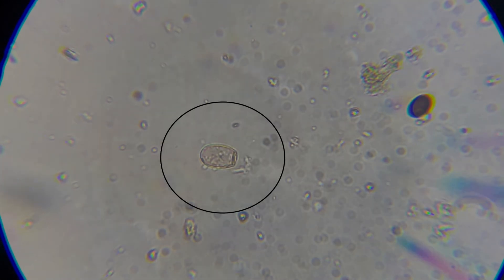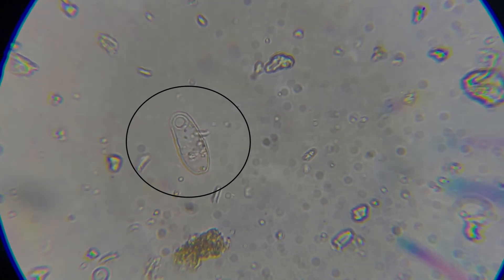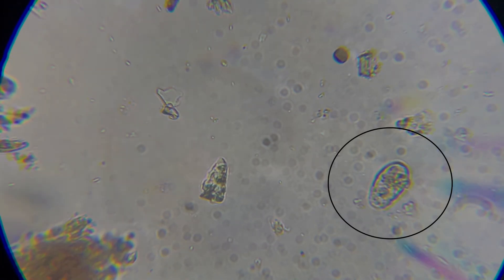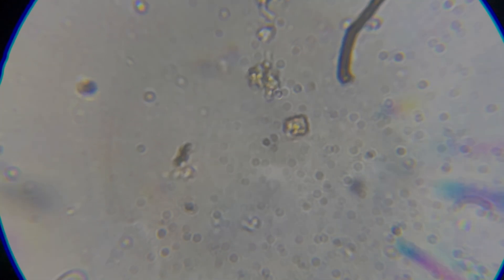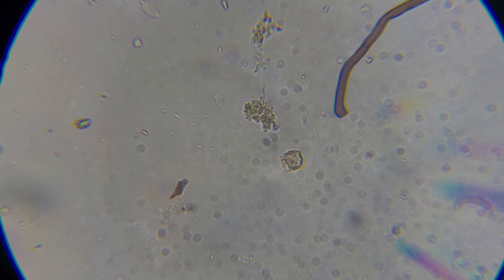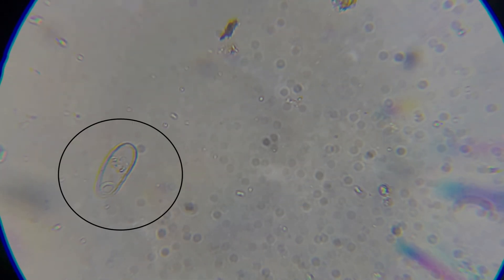Next we have a protozoa — a testate amoeba specifically. You can see the test on the right-hand side with some bacteria inside of it. Here's another type of testate amoeba — you can see its mouth parts at the top. Here's another example where the mouth parts are on the bottom side, usually the flat end of the egg shape. Here we have the tail end of some fungi — you can tell it's beneficial because of the color and shape. Here's another testate amoeba with the test visible on the bottom.